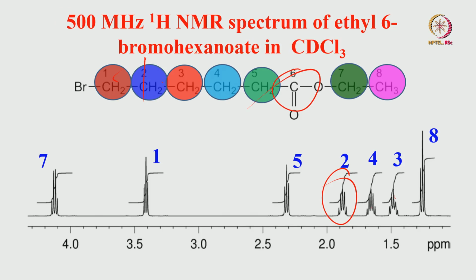Since the time is up, I am going to stop here. We will get a lot more examples tomorrow. In the next class, we will take a lot more examples. But today what I wanted to tell you is, we really jumped into the analysis of the proton spectra. This is the main aim of this course, to make you more comfortable. If a spectrum of any nuclei for that matter is given, how do you interpret it? What is the idea you have to apply? How do you go ahead in interpreting this? That is what I wanted to discuss.